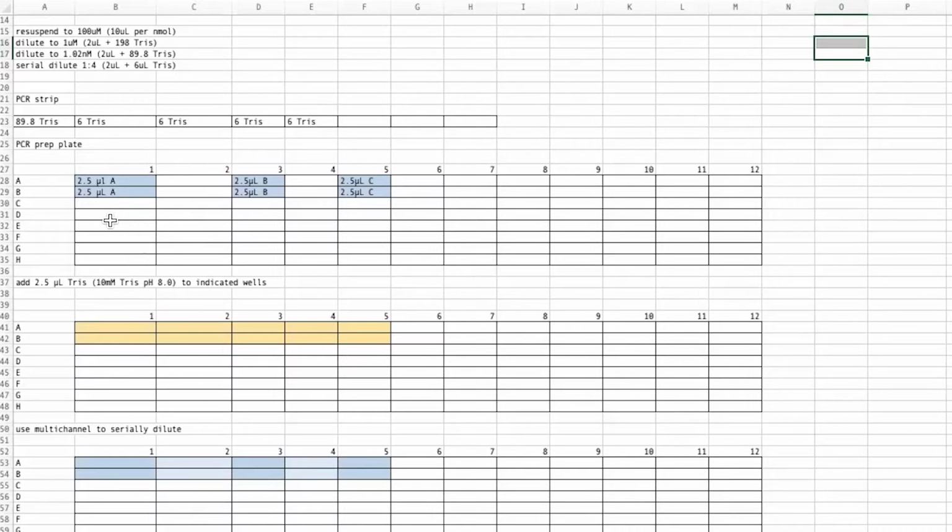Well, at least not mixing things up in the sense of confusing the samples, we are going to be mixing samples. More specifically, we're going to be doing a serial dilution. I want to do a 1:2 dilution and a 1:4 dilution in duplicate. I start by pipetting my samples undiluted into the different wells. I'm skipping a column in between so that I have room to do a 1:2 dilution here and a 1:4 dilution here.